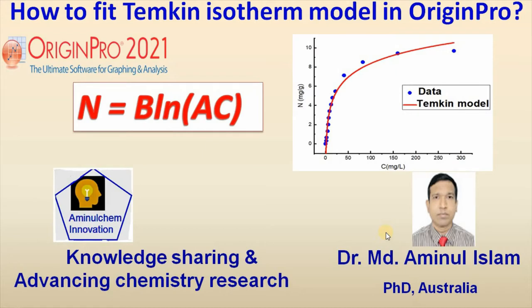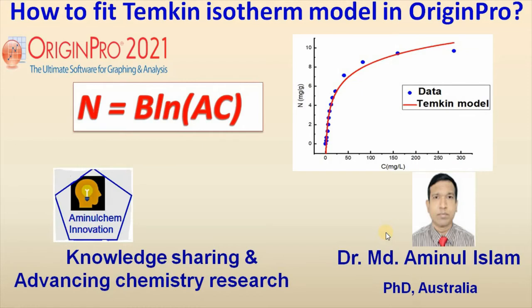In my previous videos, I showed you how to plot Langmuir-Freundlich, Langmuir-Freundlich or Sips model, and Redlich-Peterson isotherm model. Today I would like to show you how to fit Temkin isotherm model in Origin.